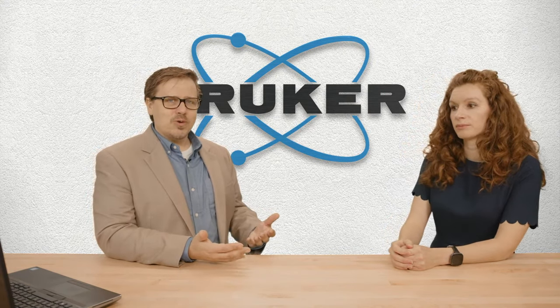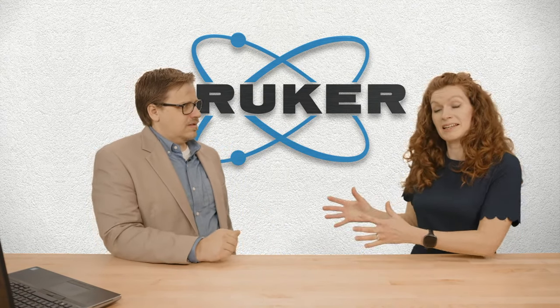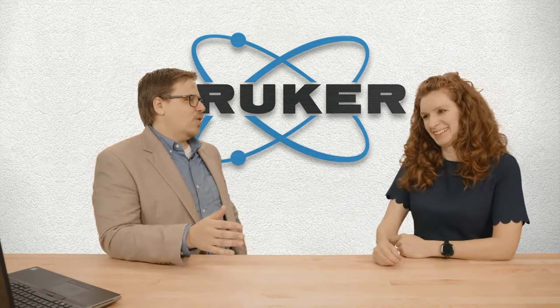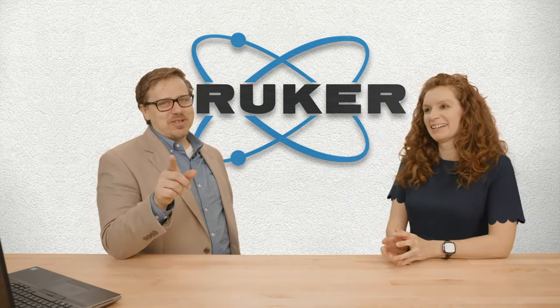Okay. So then the other part of the equation for today is this whole beyond the benchtop. So now when we talk about EDXRF versus WD, is there a certain form factor that they typically come in? Yeah, the WD system, the large floor standing, it's a bit larger. Yeah, it's not that big. It's as big as a washing machine, right? Yeah, well, about. A very expensive washing machine. It doesn't wash your clothes, just to be clear.